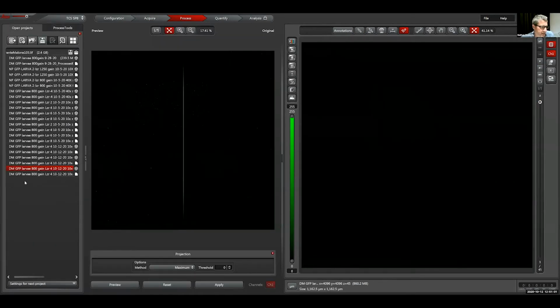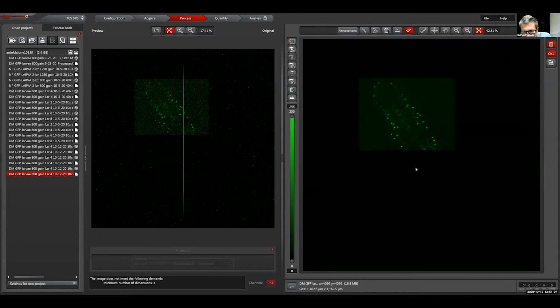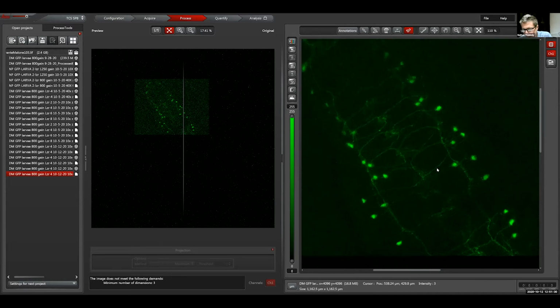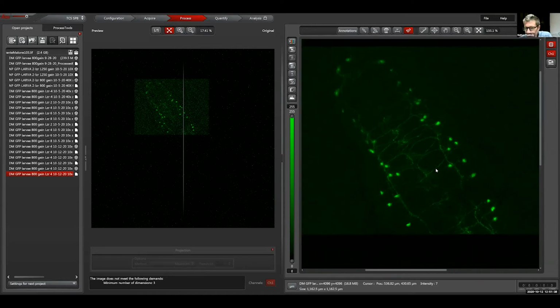Go back to open project. There's your process sample. Let's take a look at it. Okay. Now I assume if I zoom in here, so now I'm zooming in. Take a good look at that, get that in your brain. I'm going to zoom into the 512 and let's see if one is better than the other. Okay. That doesn't look too pixelated, but it's not as good as the 40x. Yeah. Okay. So that'll be something to compare to.